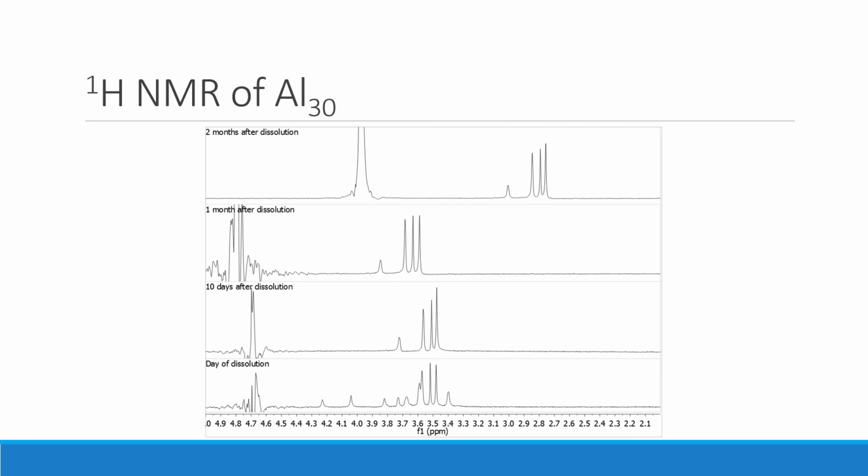I ran my sample the day I created it, 10 days later, 1 month later, and then 2 months later. And as you can see, the peaks are changing over time, which tells us that the composition of the clusters is changing over time. This is just a short bit of information about a rather complex topic.